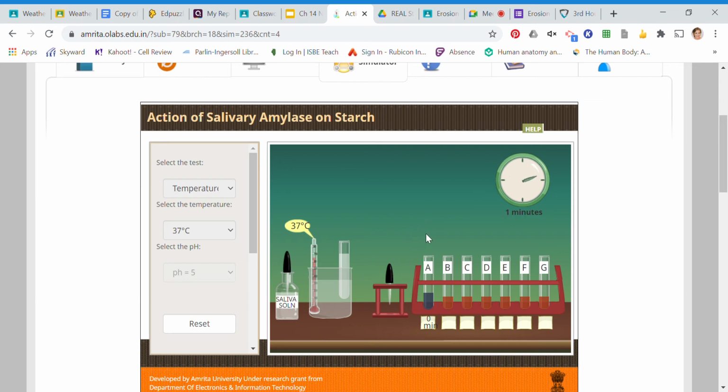Now we're going to continue adding this every 2 minutes to our test tube. You don't have to do it exactly at the 2-minute mark, but you have to do it within this time frame to then have it recorded. So I'm a little bit off, but I'm going to do it again. Going in from the top, I stick my pipette into the solution, I drag it over to my test tube, and I'll add my solution. Notice it'll record the time down here at the bottom for you, so you don't have to type anything in here.